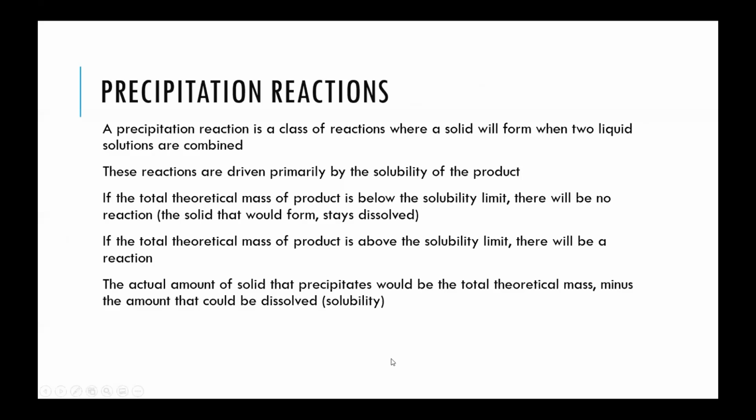So both of these reactions, the first reaction and second reaction, are precipitation reactions. And you've seen these before in videos or in lab, and that's where you have two liquids that are mixed together and they form a solid. That solid is dispersed throughout the liquid. There's still a lot of water there because that's the solvent, but these two solutions are mixed together and the product is a solid sample.